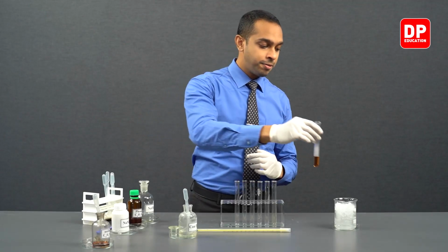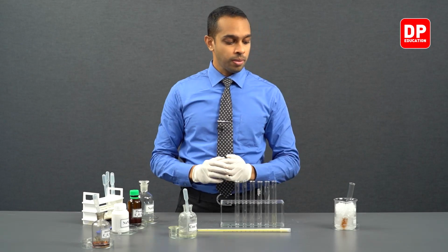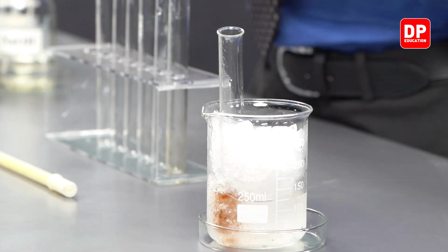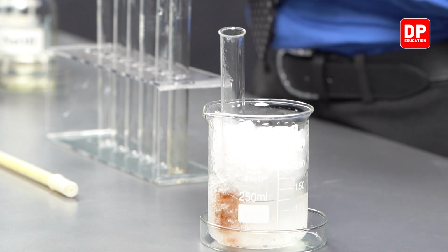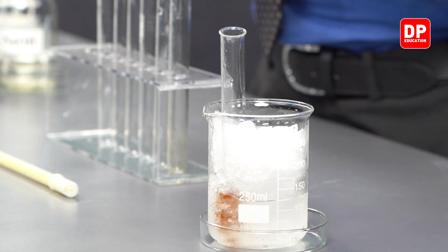So now we'll allow this sample to cool down. It has to cool down below 5 degrees Celsius. So we are using an ice bath to cool down the sample below 5 degrees Celsius.